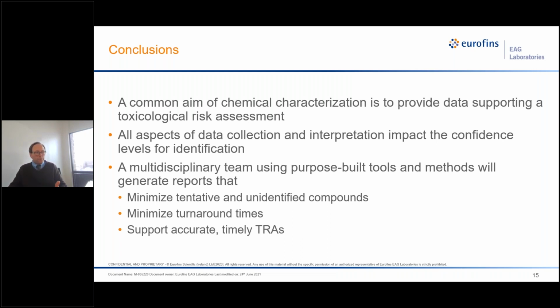And the last one, I would just like to conclude that a multidisciplinary team using purpose-built tools and methods will generate reports that minimize tentative and unidentified compounds. They're going to minimize turnaround times, and they're going to support accurate, timely TRAs. So going way back towards the beginning to that slide I showed, where it was the conceptual workflow, we ended on the toxicological risk assessment. And for the purpose of this discussion, that was a good stopping point.